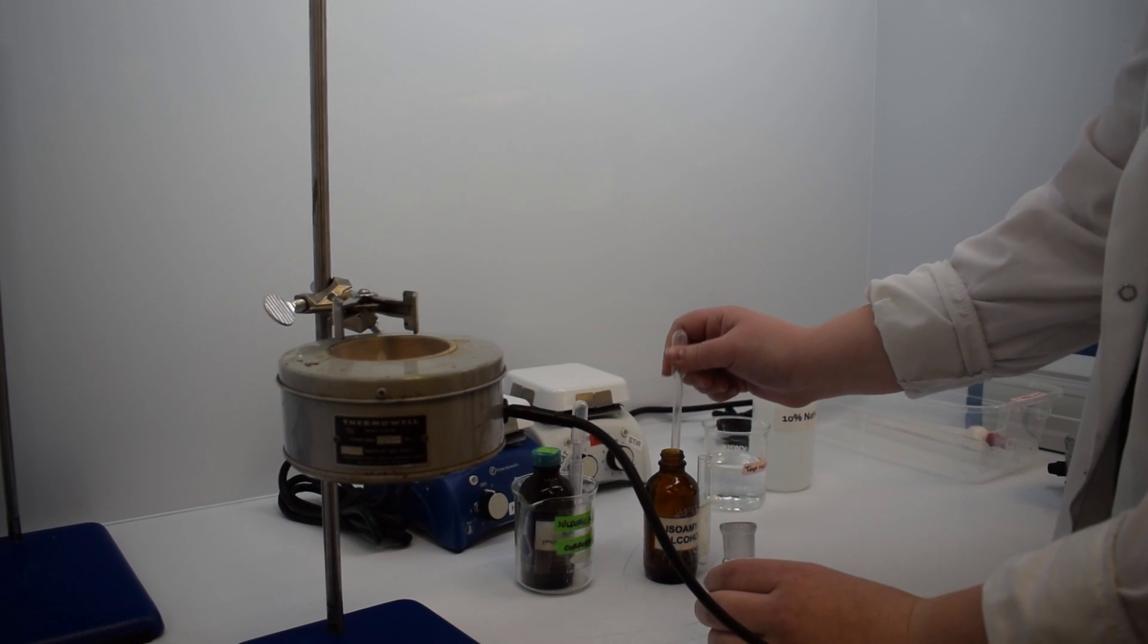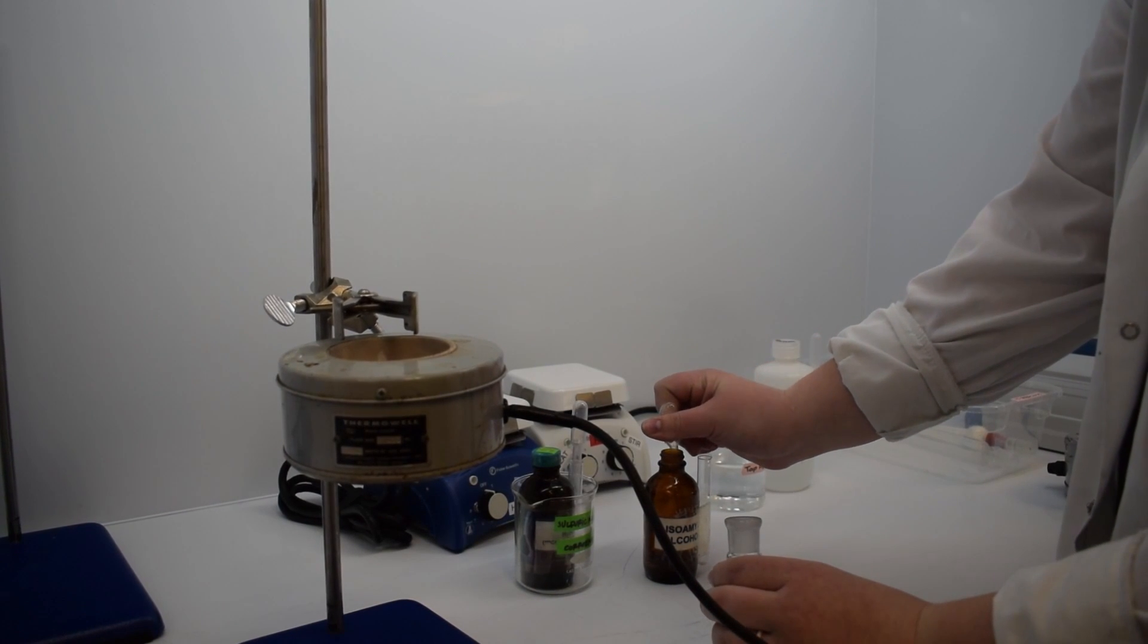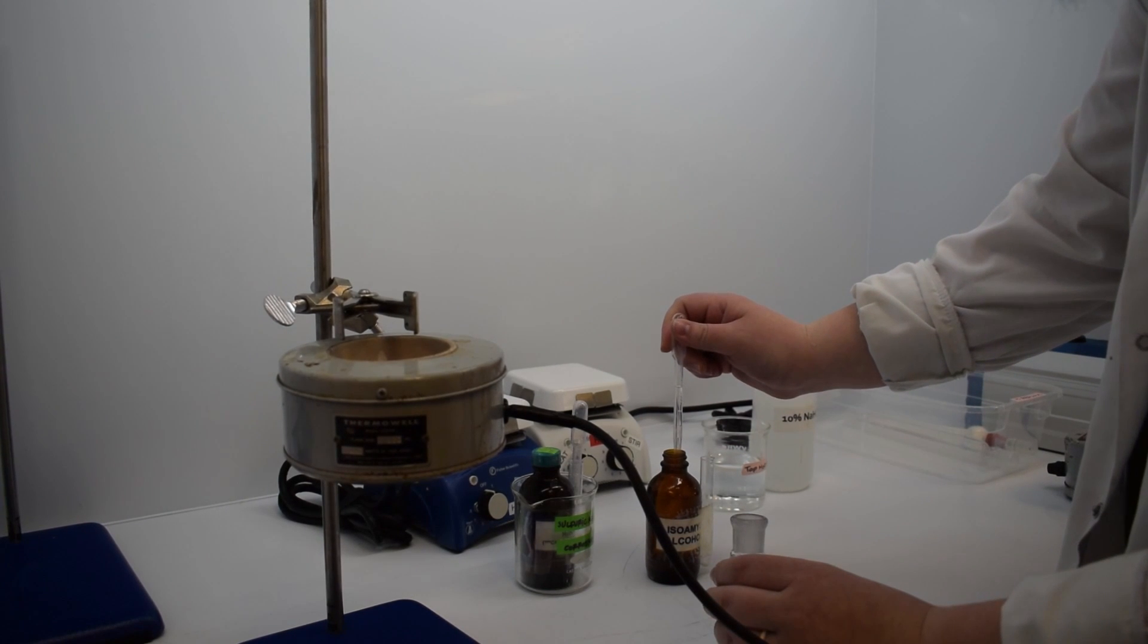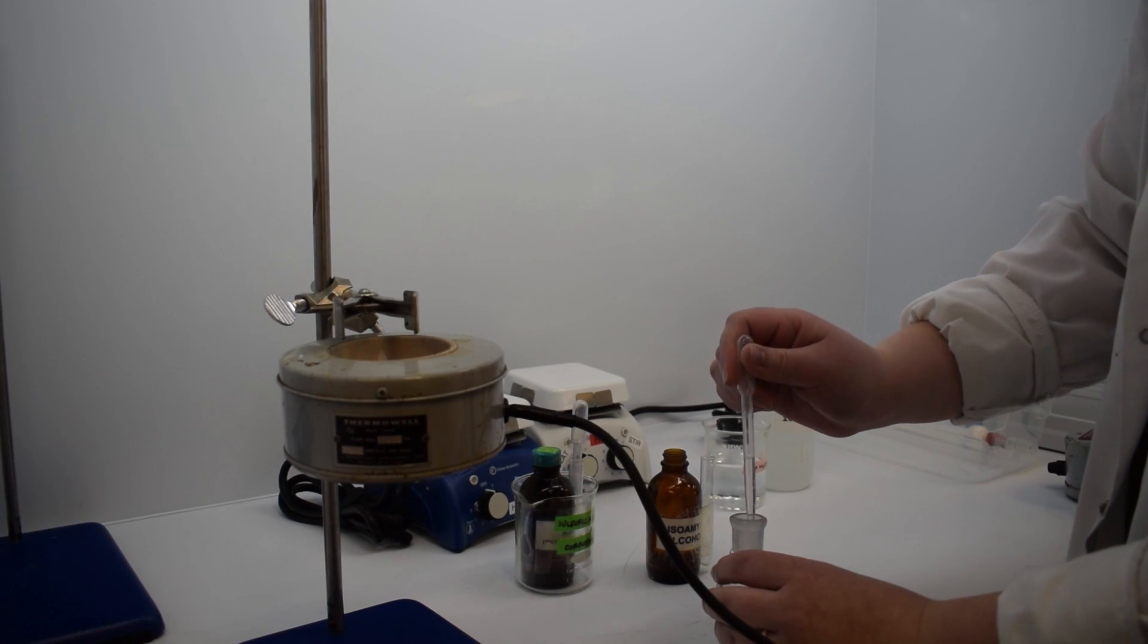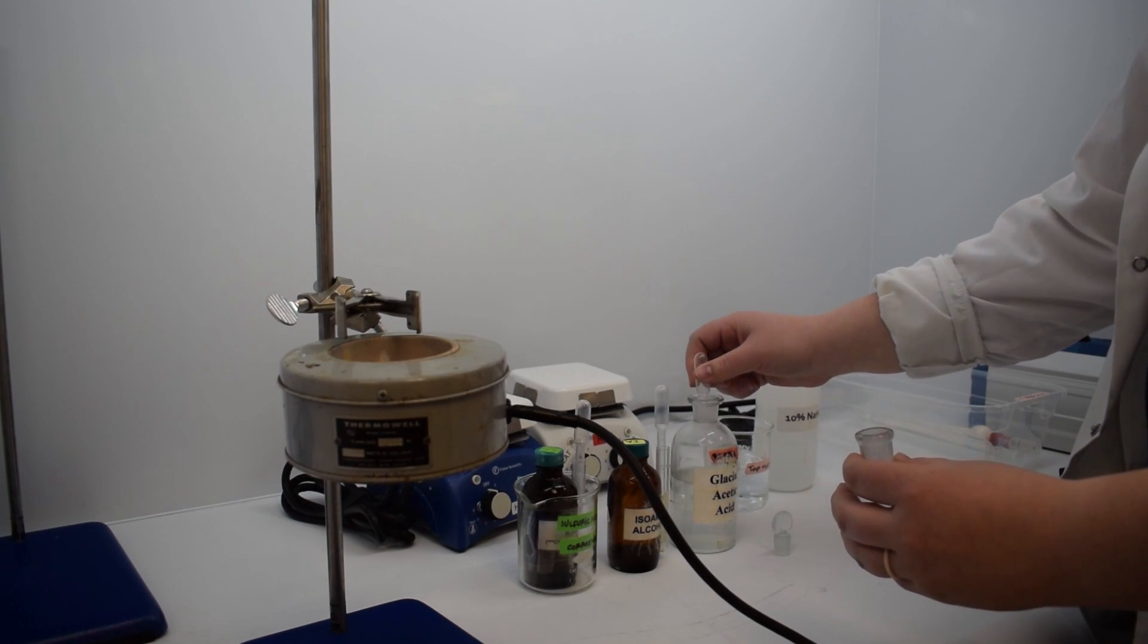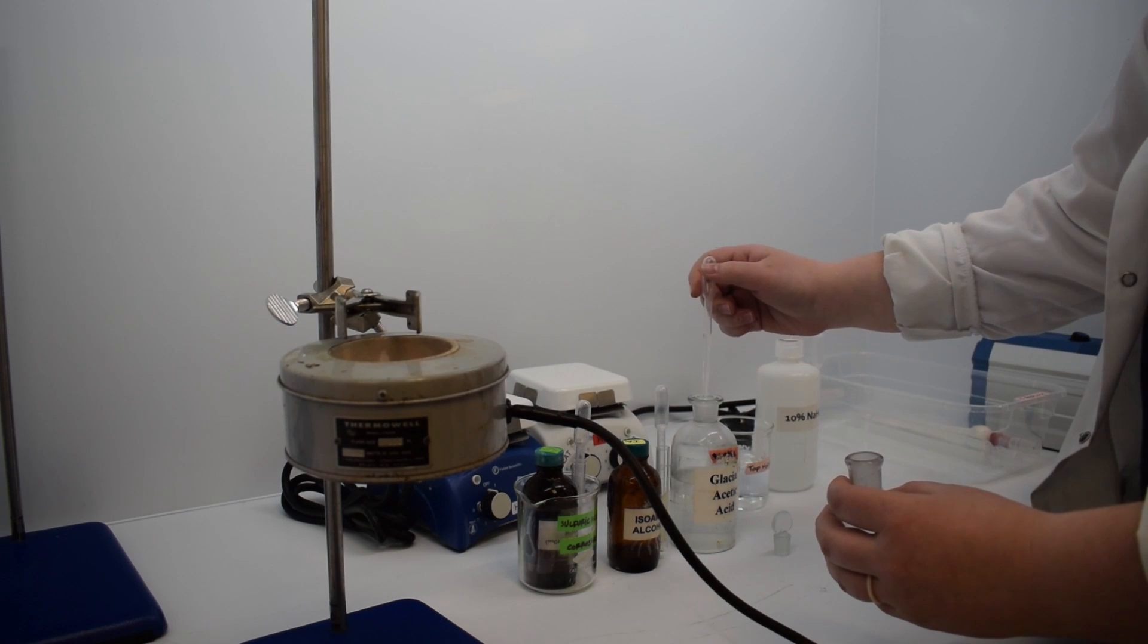We are going to begin with the synthesis of our ester. First, we are adding three milliliters of the alcohol reactant to our round bottom flask. This round bottom flask already has three boiling chips in it.